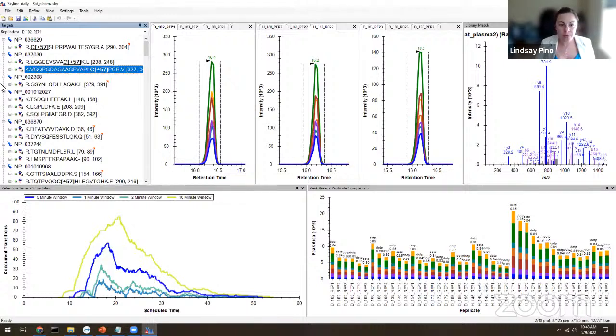So these samples, some of these already came preloaded. Oh, I will double check the Q&A. Sorry, I had navigated away.